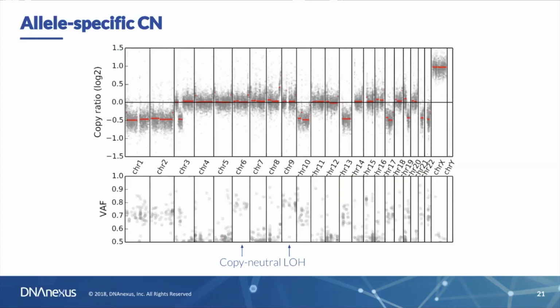What else can we do? If we provide a VCF file as app input, we'll also get a plot of the SNP allele frequencies at the same positions across the genome. Here's an example, not the same one from the same cohort, but a different one where we see some large-scale alterations that I will just quickly point out. Chromosome 1 is lost, chromosome 2, also a single copy loss, a little bit of chromosome 3, and I see losses on 10 and 13 as well.